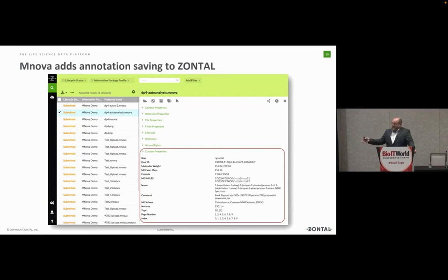I wouldn't even try to differentiate. Yes, we read data from instruments, we're pulling data in, that's fine. We're also pulling data from TetraScience, because that's where people have data. But usually what we are doing is go directly to the instruments and read the data. Because everybody wants the whole track record of what has happened to this piece of data that comes from there, because this data record on the instrument is only there because somebody was planning it in a different tool to actually execute it, and then run this instrument.